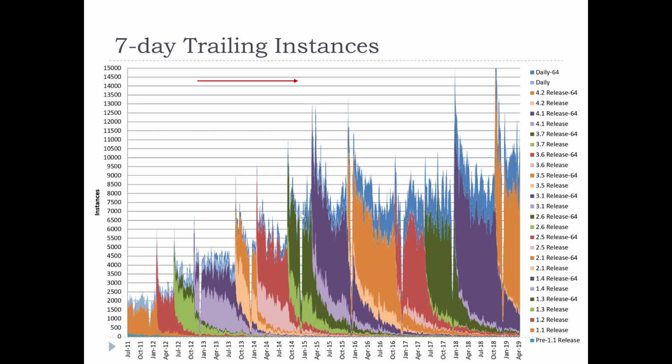I think it's slowed down some in the last several years, but it's still clearly a popular tool, and again useful to know. I think from this, one thing I can say for sure is that we've utterly failed to make mass spec so uninteresting that people don't do it between Christmas and New Year's.